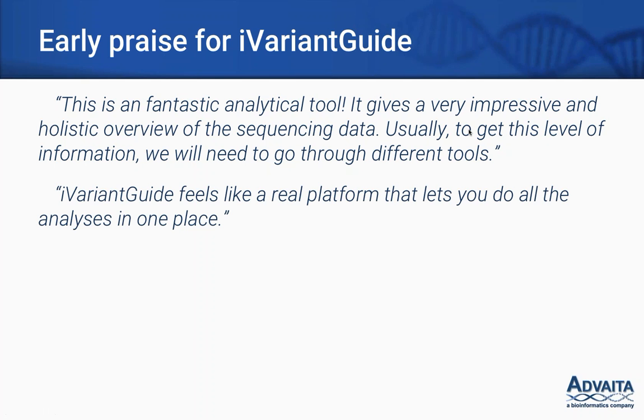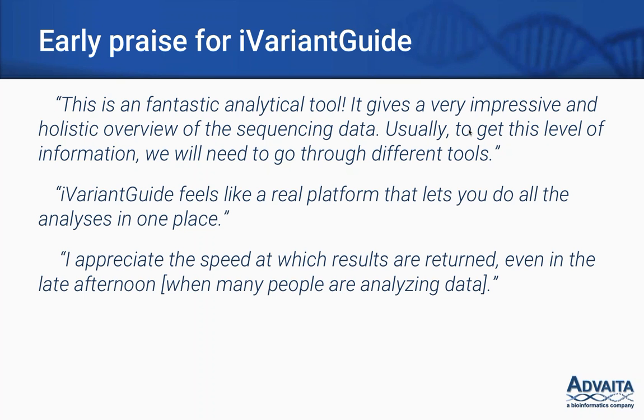Others have also commented on the speed of processing data. The worst is when you set your data to process right before you leave for the evening and then come back in the morning only to find that it has failed overnight and you have to start all over. Even at high traffic times, we keep the upload and processing to less than half an hour, generally.